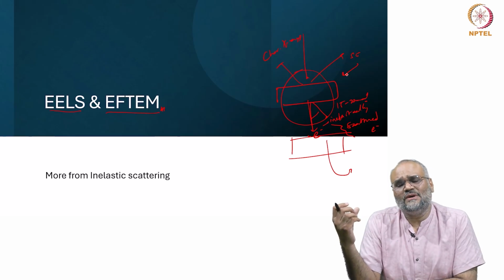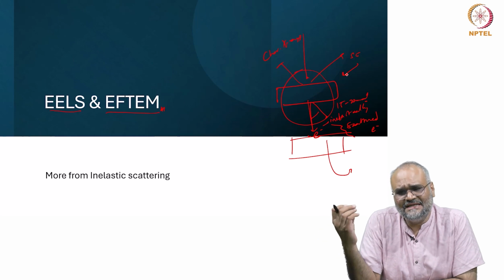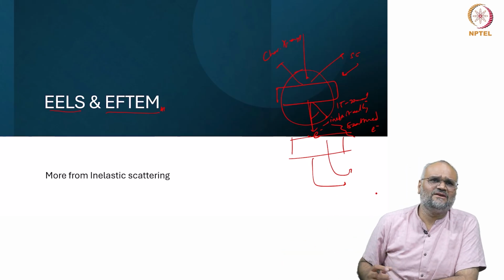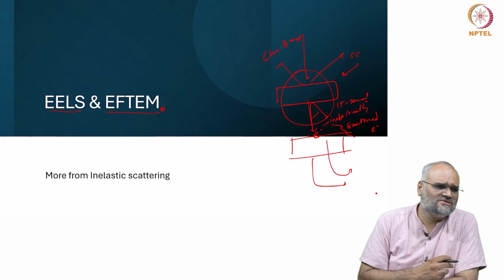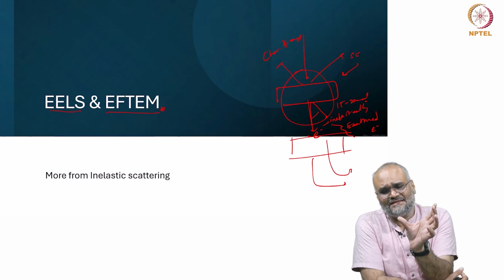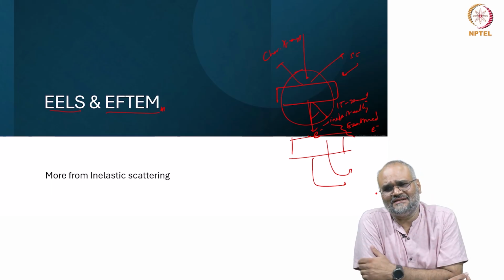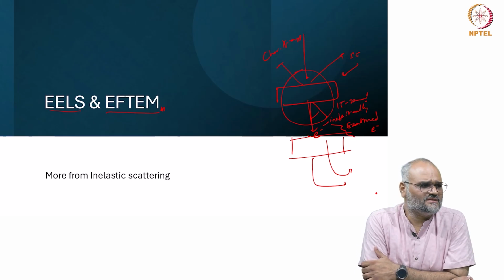Whereas you have either in-column or post-column construction for the EELS signal, and you're collecting it and sending the signal out of the microscope column, and analyzing it through different computational tools outside. So primarily the spectrometer which is placed below the microscope column is called a post-column filter, and this is more commonly used in modern day spectrometers.